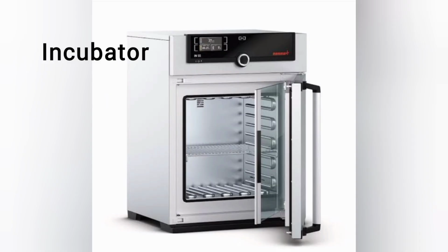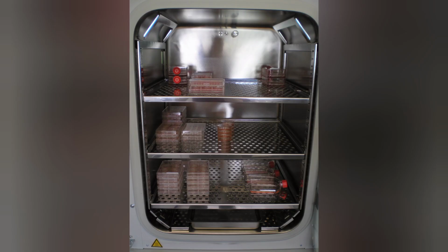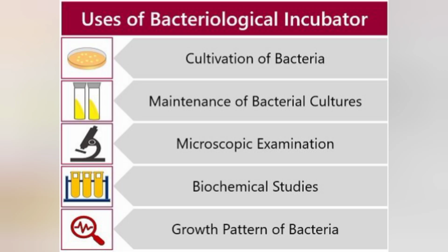Third equipment is incubator. Incubator in pathology is a kind of insulated box in which heat of a particular temperature is generated in the inner space and is used to grow and maintain microbiological or cell cultures. Incubator maintains optimal temperature, humidity and gaseous contents in the inside atmosphere.